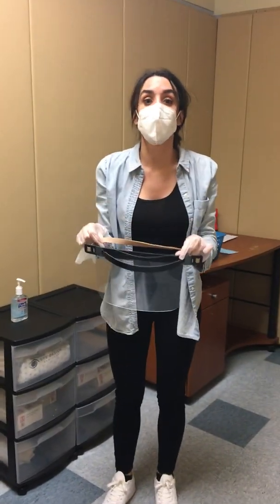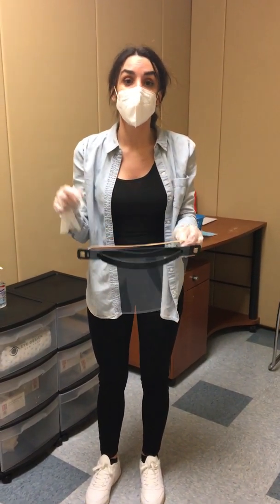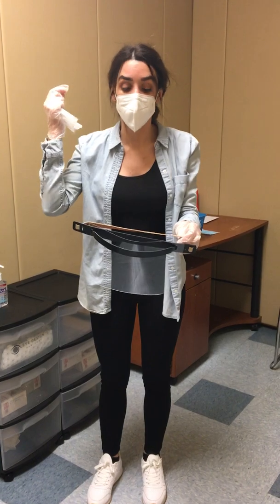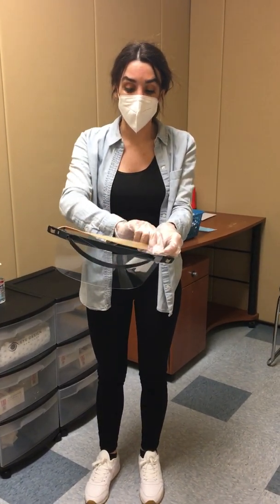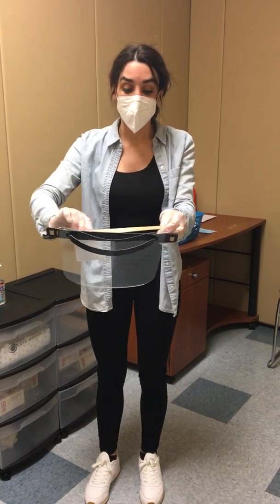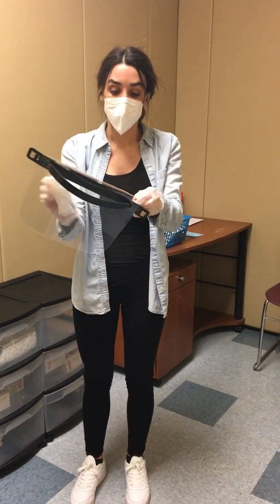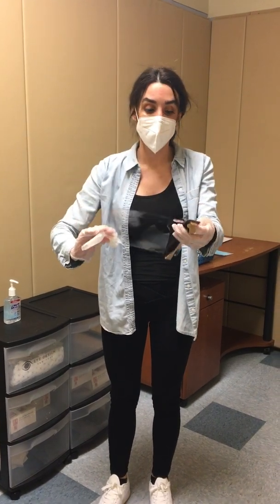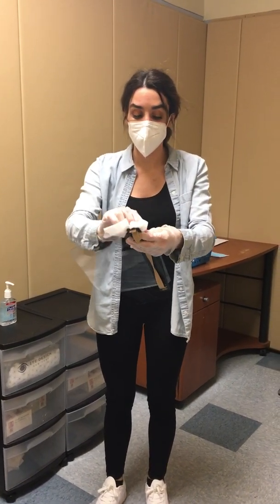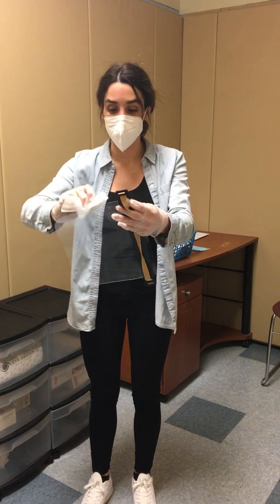And this would be the same exact thing I would do if I was removing goggles. I would have removed them in the back as far as I could at the earpieces. And then, because again I am going to reuse this, I would first start by doing the strap back here, and then I would move from the inside and then go to the outside, because I would want to disinfect this from the cleanest part, which would be the inside, to the dirtiest part, which would be the outside.